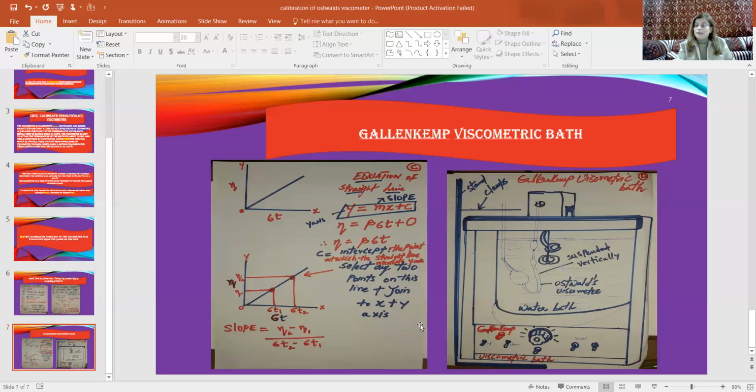And how you find beta, I just mentioned it too. That is the calibration constant. How do you find absolute viscosity? You have the formula: absolute viscosity equals beta rho t. See how many parameters you can calculate easily by simply plotting a very simple graph. So this is how you go on with viscosity. Isn't it interesting? This is very interesting. I just adore this topic.